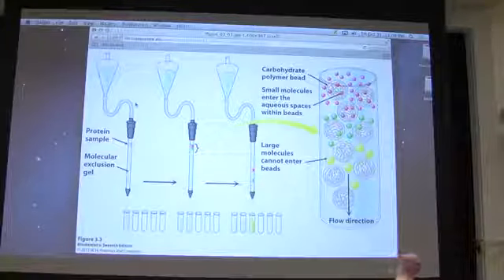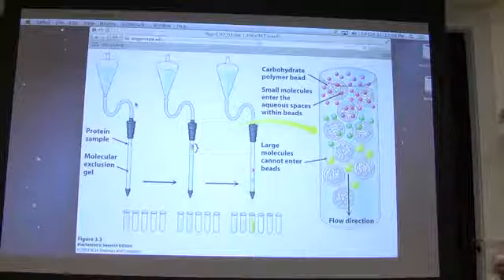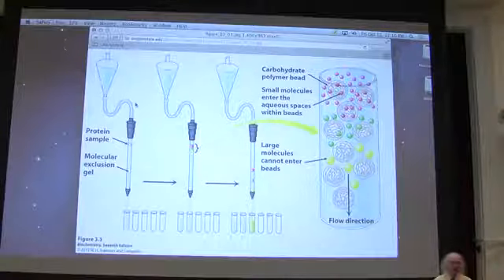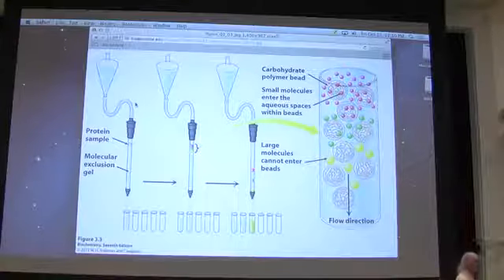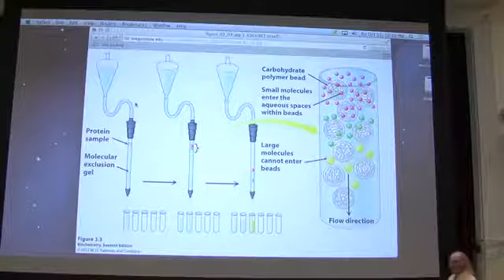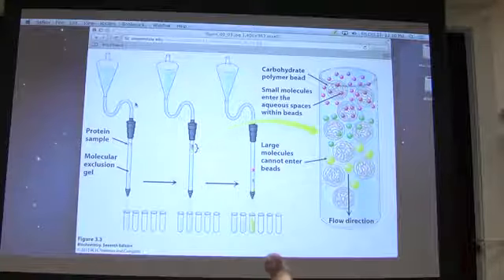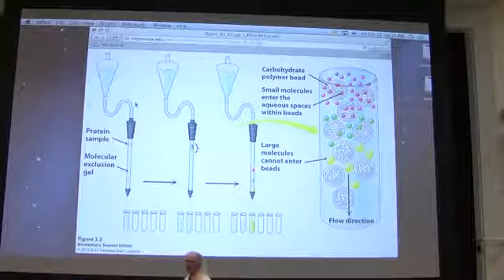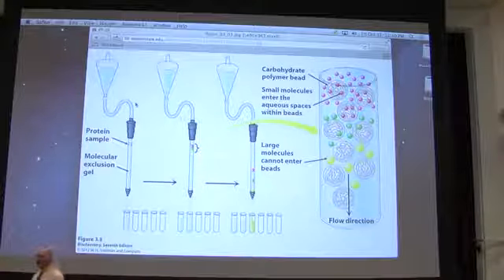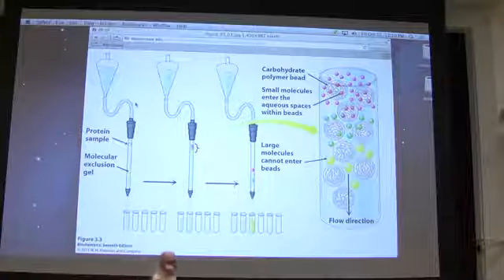So I gave you an example of some proteins that have a size of 5,000 in molecular weight and some that have a size of 80,000 in molecular weight. If I used a set of beads that had an exclusion limit of, let's say, 30,000 molecular weight, what it would mean is that anything that has a molecular weight of less than 30,000 will fit in there, and anything that has a molecular weight greater than 30,000 will not fit in there. Everybody got that? So the exclusion limit determines which things will fit in there.